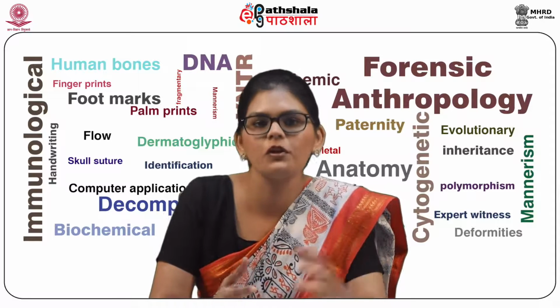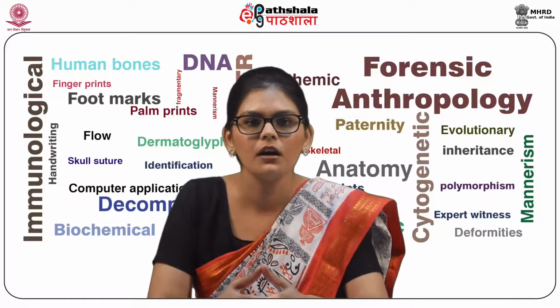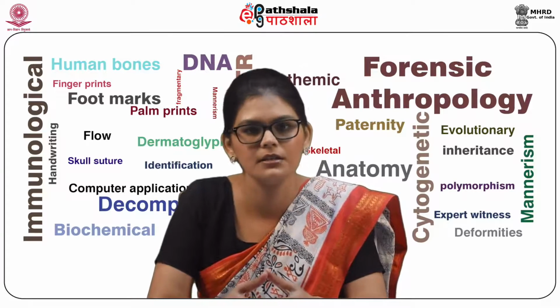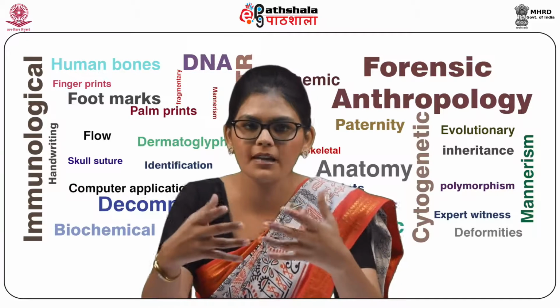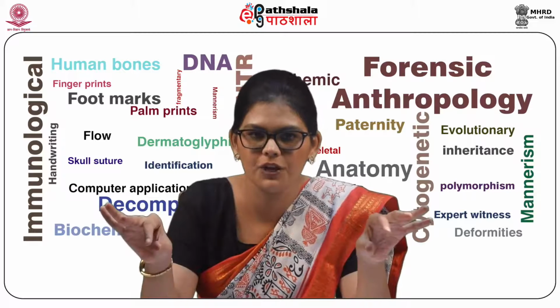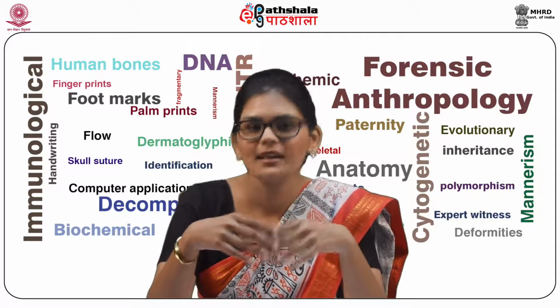The morphological examination routinely involves a two-step process using a comparison microscope. The first step is the identification of hairs and the second step is the comparison of questioned and known hairs. During comparison, the length of the hairs as well as the maximum number of microscopic features is considered.